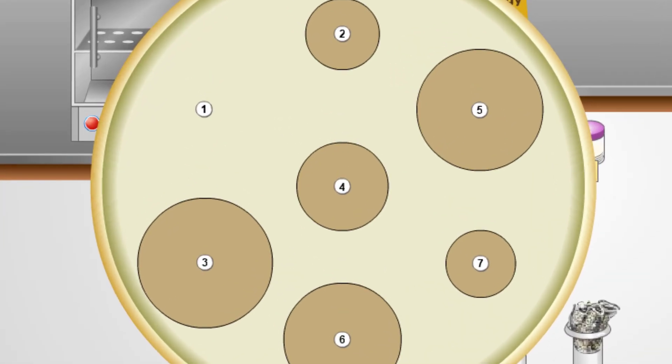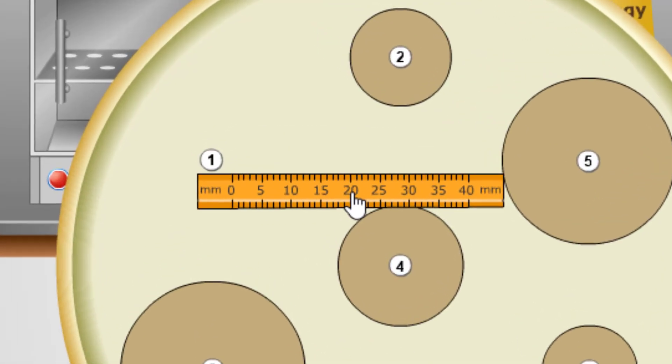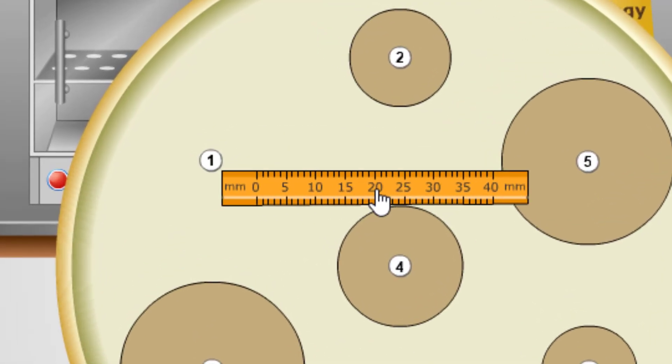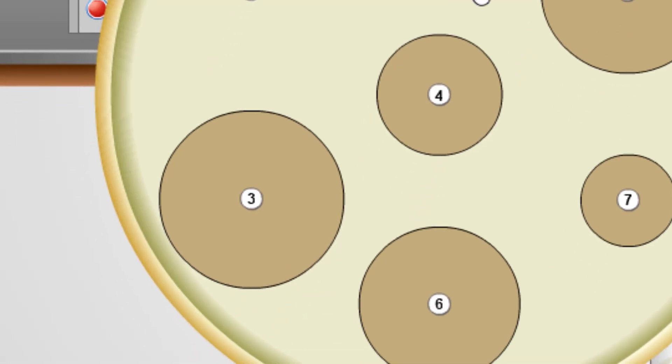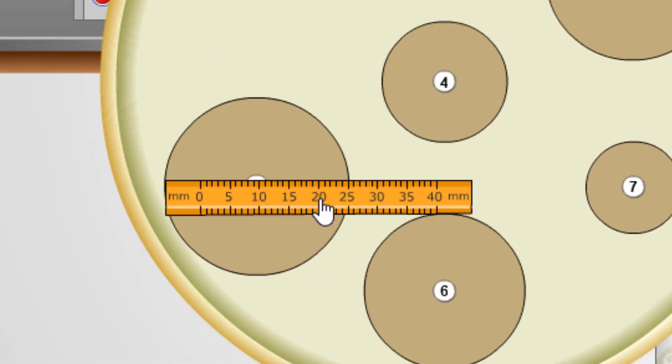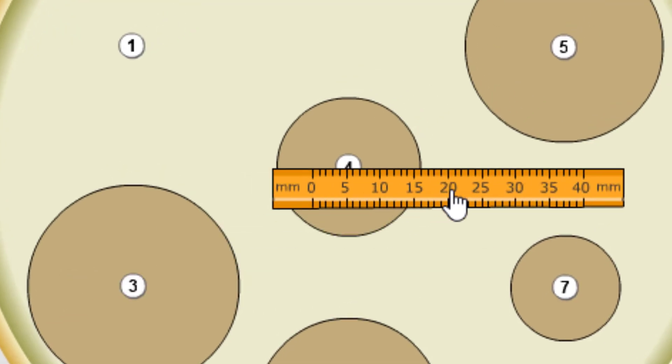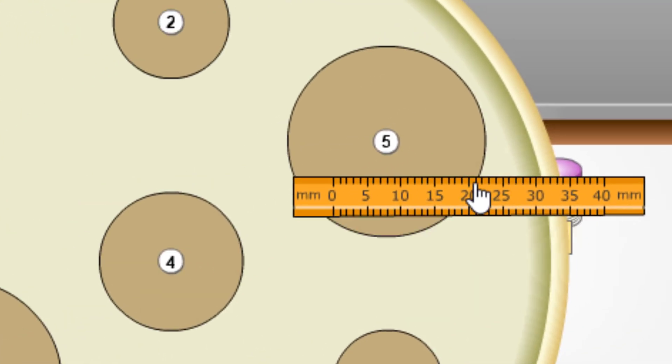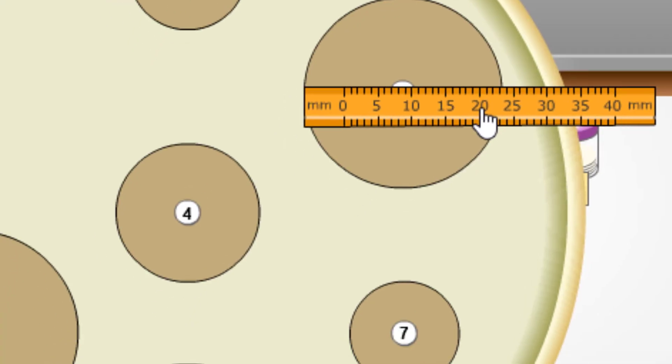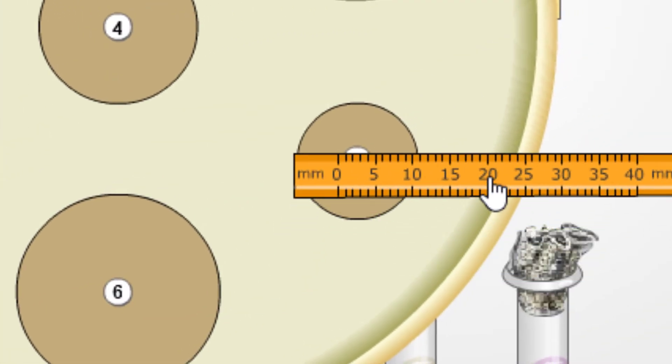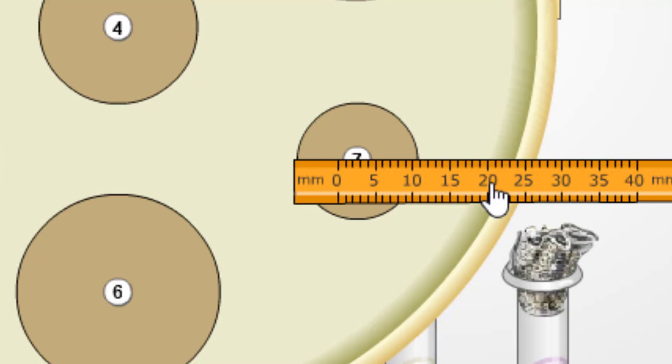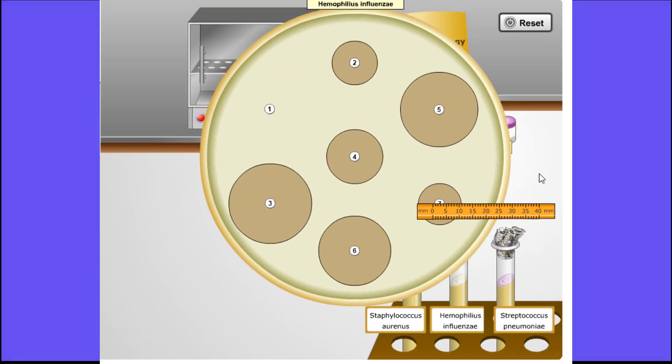Let's measure our zones of inhibition. Our control does not have a zone of inhibition, so this is good. Now that we have our zones of inhibition for each of the antimicrobial substances, we can try our last bacteria.